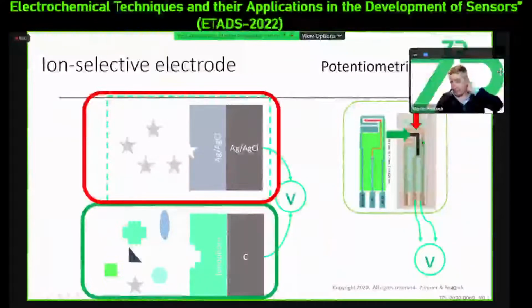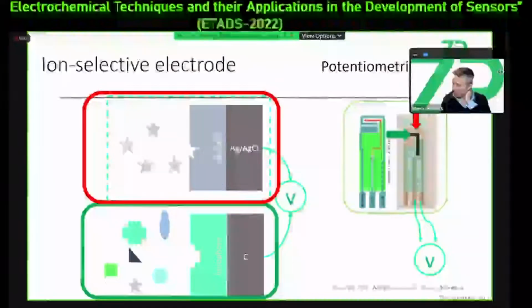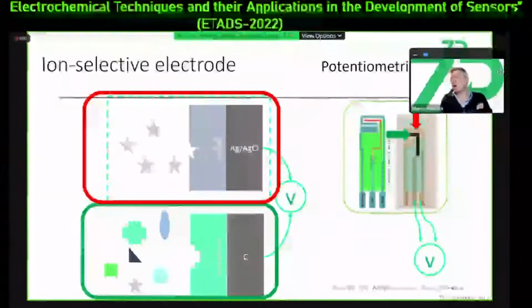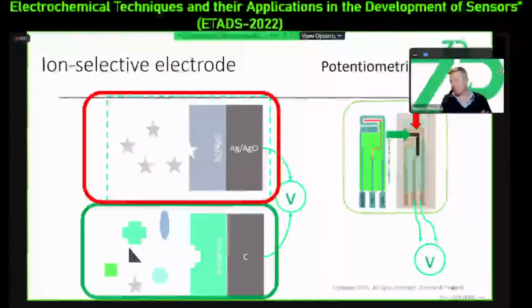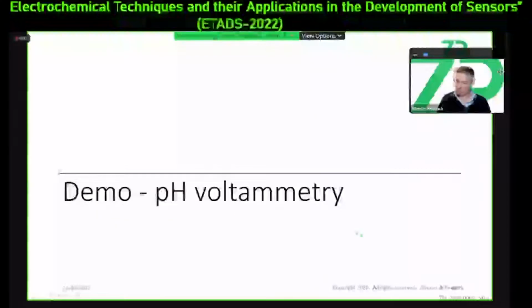And the nice thing about these modern instruments is they will just change the mode of operation from being amperometric to potentiometric, and the software will just do the switching for them.